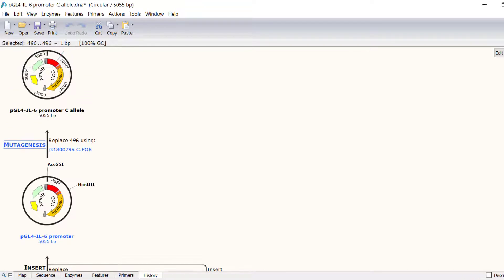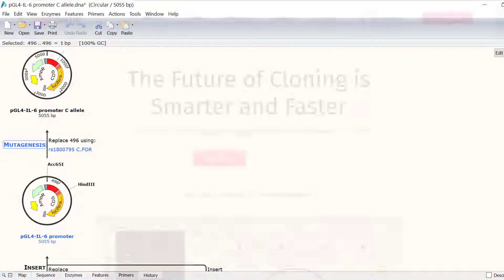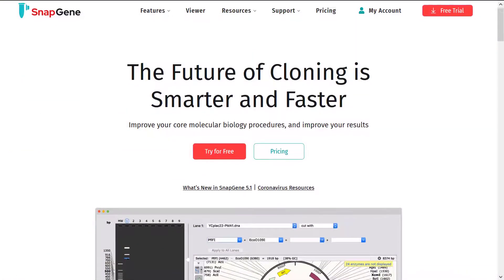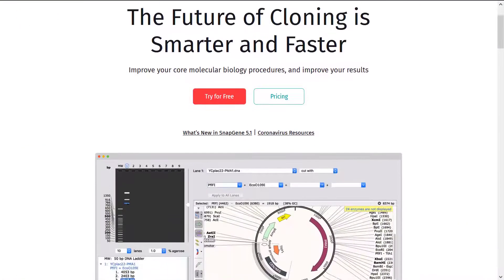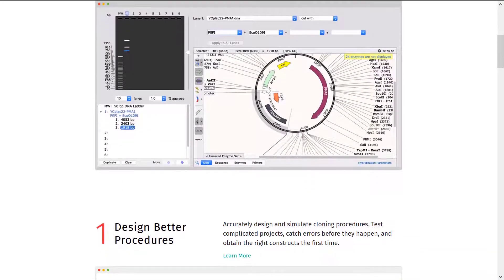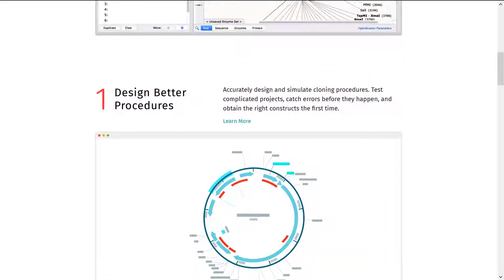In this tutorial, you have learnt how to design mutagenic primers and simulate a mutagenesis reaction in SnapGene. For more information about simulating other techniques in SnapGene, check out the tutorials on the SnapGene website.